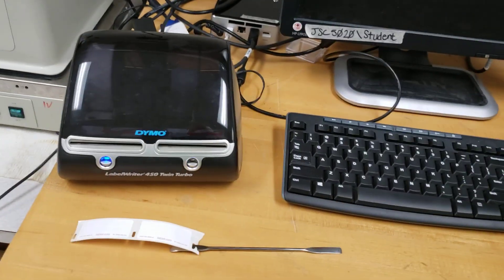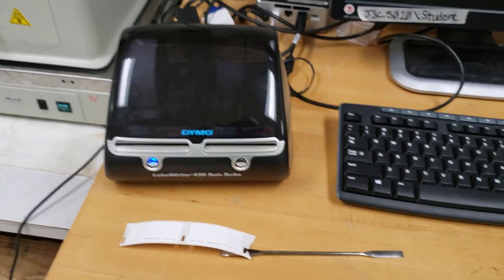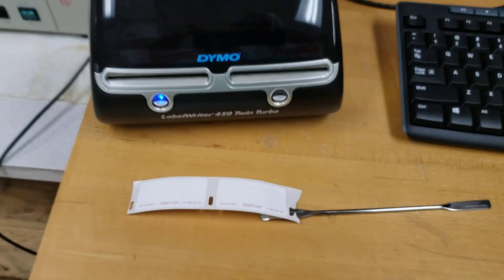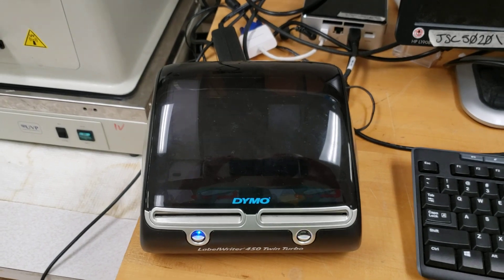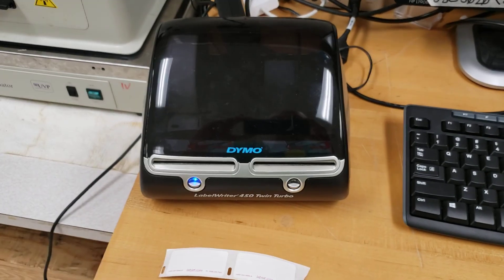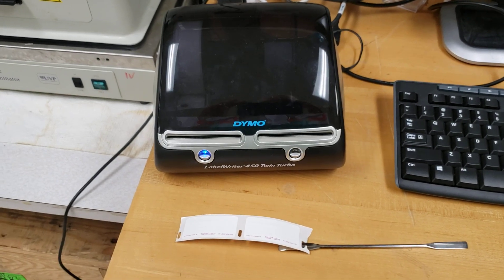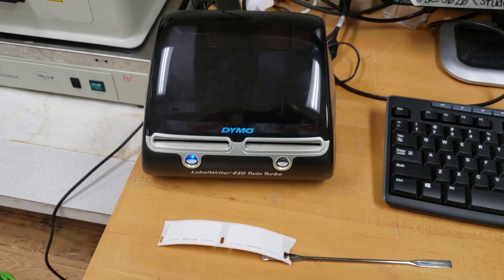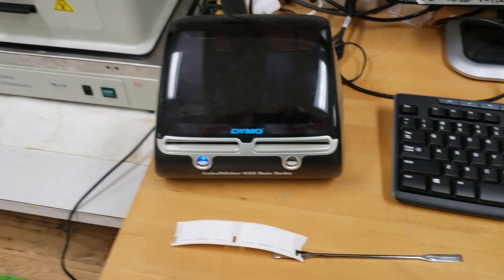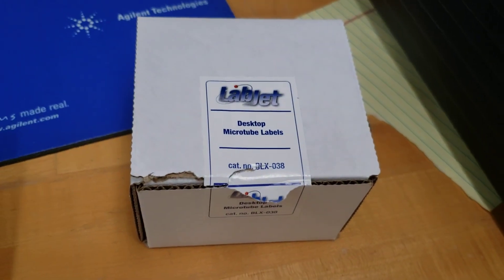Here's my Dymo printer. You can buy more specific lab printing material from Fisher and other companies, but I found these little labels from LabJet are relatively cheap. I bought a $75 Dymo printer and students print out their plasmid information — it automatically puts a date on it. We were handwriting everything before and just could not keep up. Now we have a specific nomenclature students must record in a certain pattern — all they do is type it, hit print, and it's done.